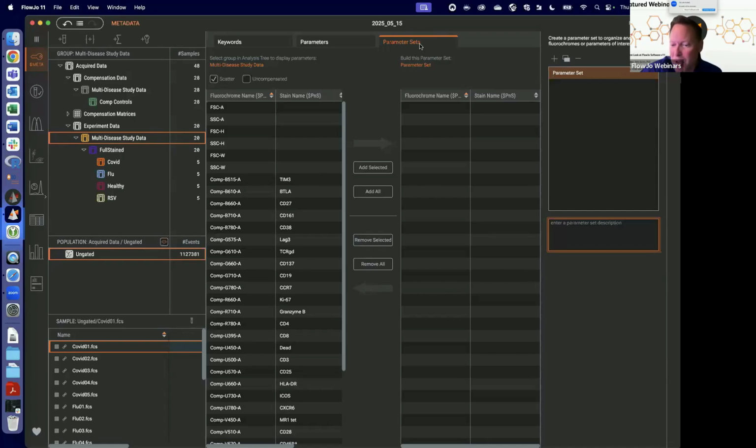Can you perform a parameter path here? I'm not sure what perform a parameter path here is. Maria, if you would mind explaining. Oh, parameter math. Okay, so creating like derived parameters. No, we have not built that one in yet. No, no problem. I'm sorry on me for not having built in parameter math at this point. You can create some derived parameters, but that'll usually be from doing something like clustering or a t-SNE dimensionality reduction.